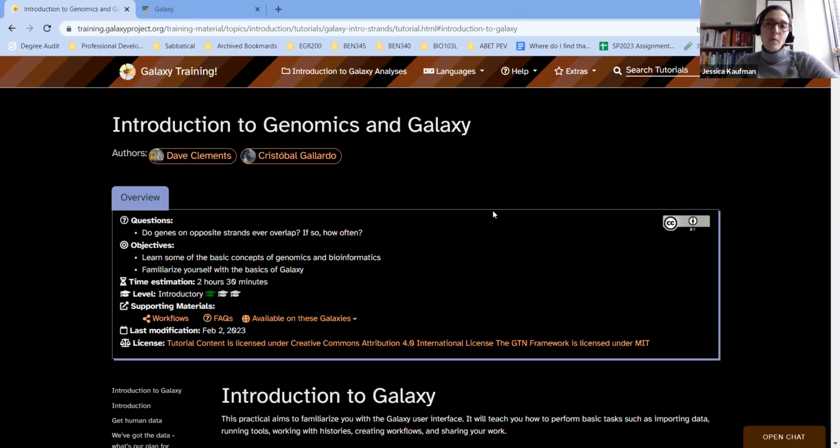In this video, I'm going to walk you through the steps you need for the Introduction to Genomics and Galaxy tutorial on the Galaxy Training Network. You're going to do this tutorial for the bioinformatics class as a really nice way to get used to the controls on Galaxy. I like this tutorial a lot because they've done a really good job of setting up practice with clicking the different parts of the window and learning how to set up tools.